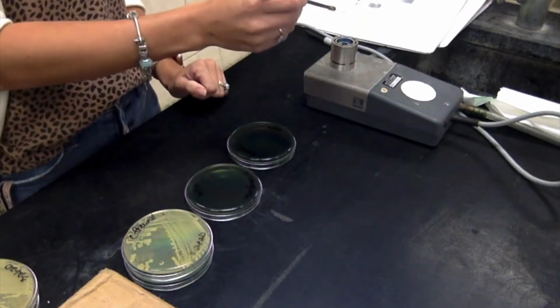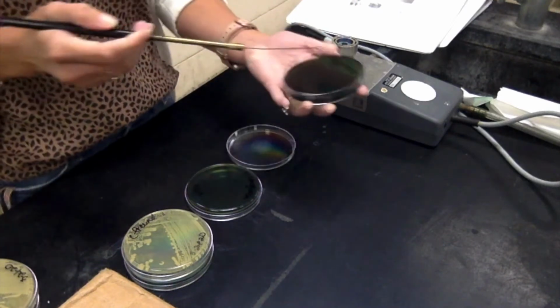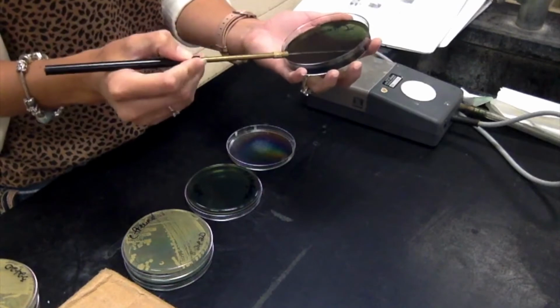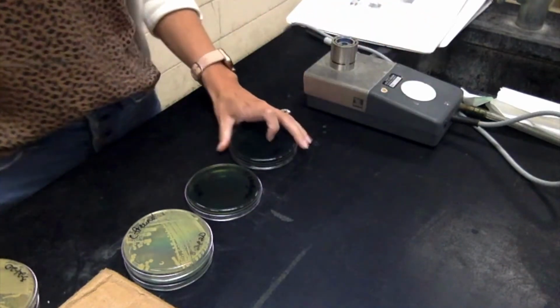But it does produce H2S, so hopefully we'll get some black colonies. Sometimes it produces black colonies and sometimes it doesn't. It can be kind of temperamental sometimes. This media is soft. Okay.